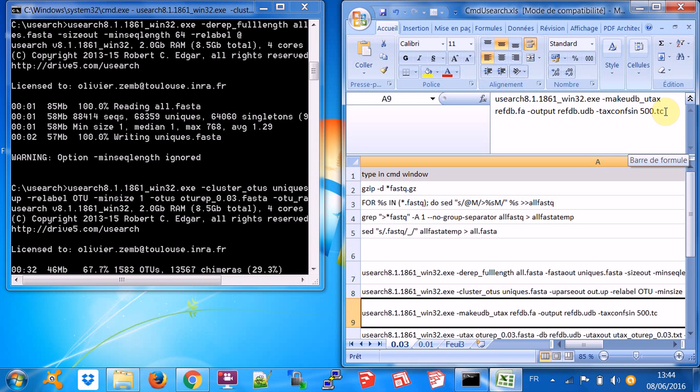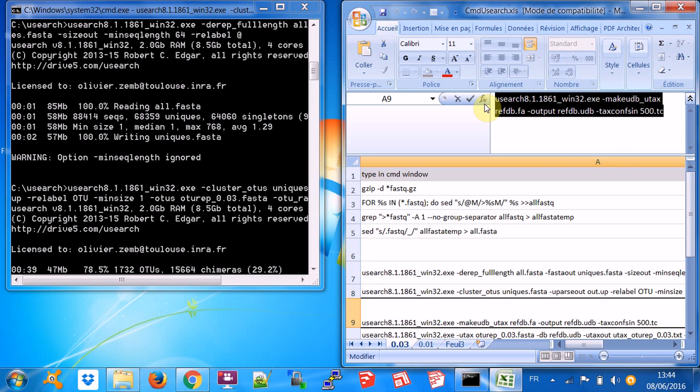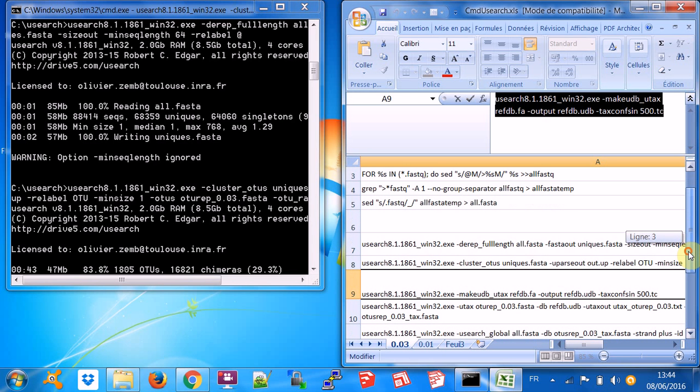Okay, now we can go, it's almost done. Of course it's very quick because I only have 2 samples. Right, waiting a little bit more.